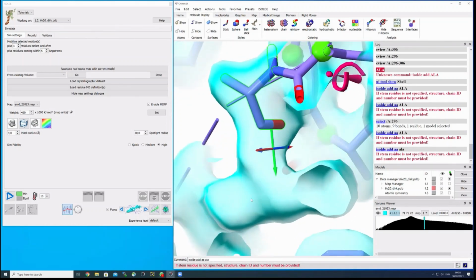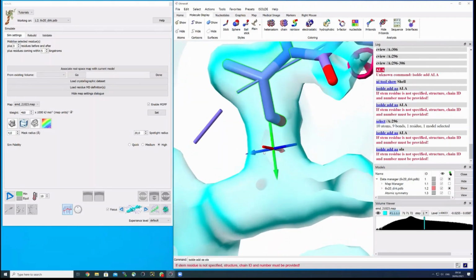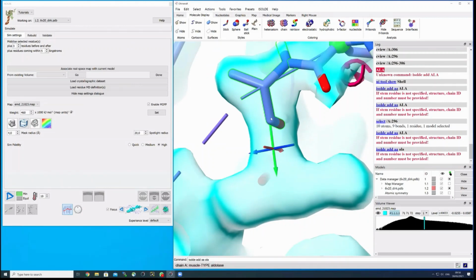Okay, then I don't know. I played a bit with it a week ago or so, 2 weeks. Yeah, but there's such a command in Isolde now, and I will dig it out for next time.